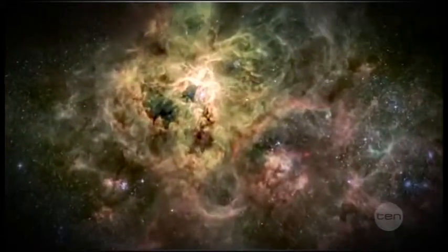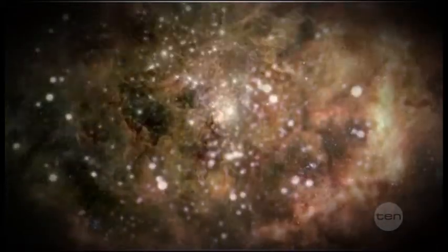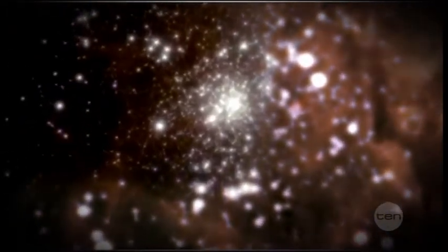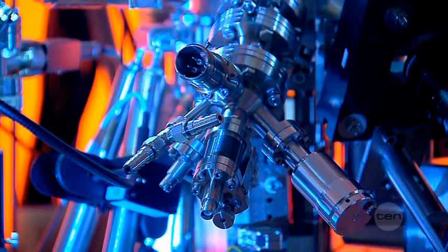Everything in the universe is made of tiny units called atoms. And atoms are so small, they are almost impossible to see, unless you have one of these.